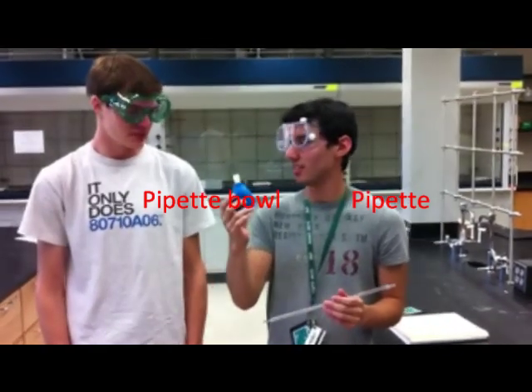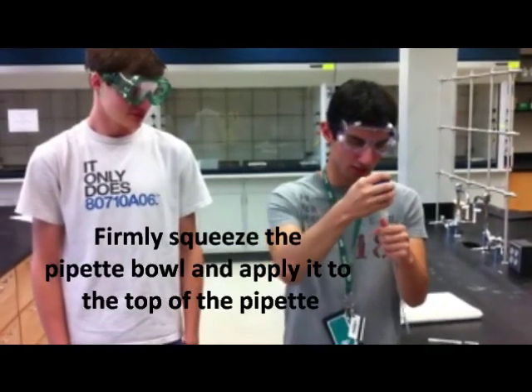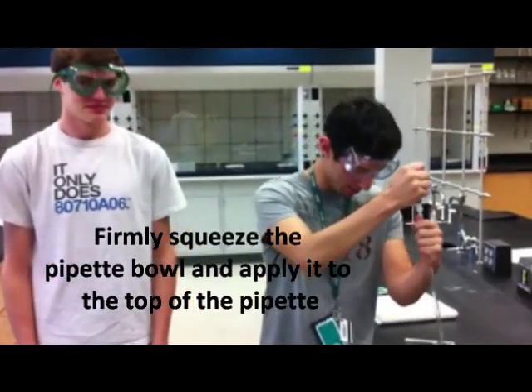These are like the old fashioned style, not the fancy roller kind. That's what I thought we were going to be using today.